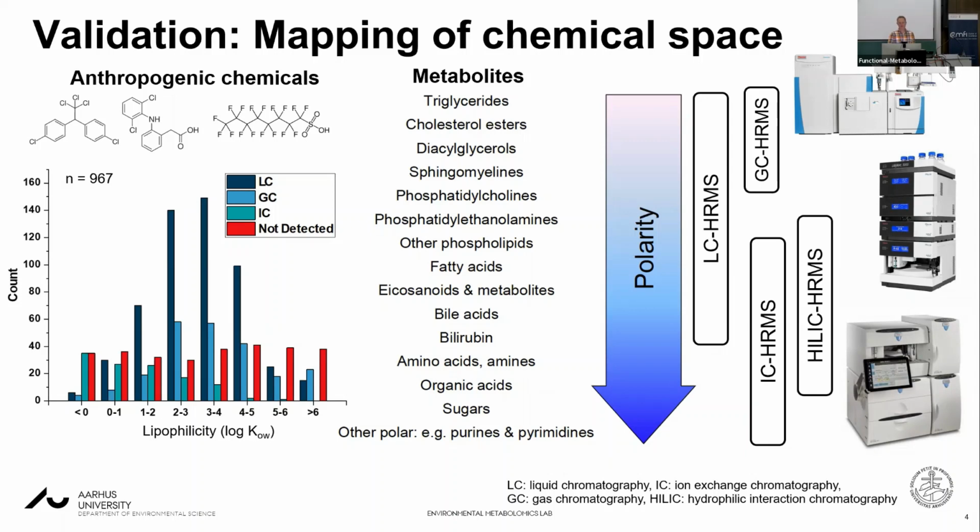So there you really need to take the raw water sample and maybe evaporate the water or just inject the water directly. And I think this ion exchange system is a very interesting system for those molecules that are very mobile in the environment and contaminating drinking water supplies.